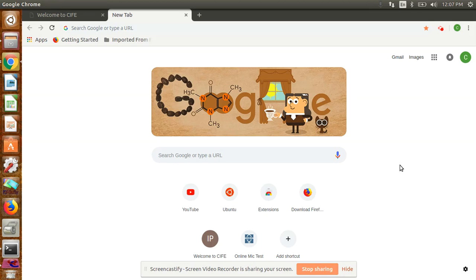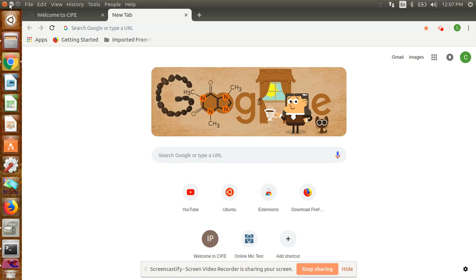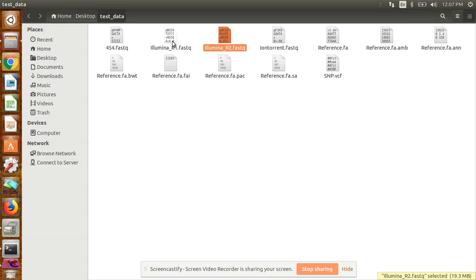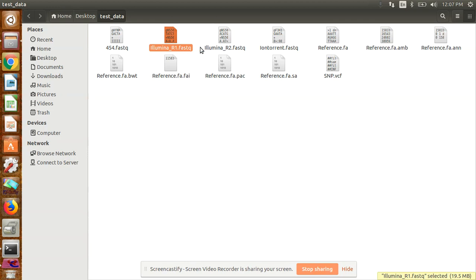I generated my data from Illumina platform using paired-end sequencing. The sequences look like this for paired sequencing: you can see the forward sequencing called R1 in FASTQ format, and Illumina R2 also in FASTQ format.